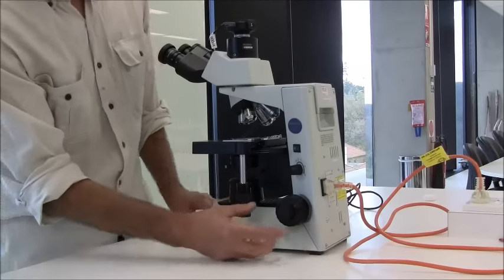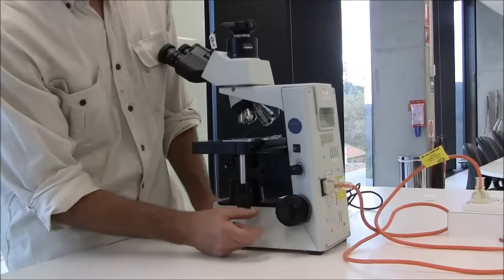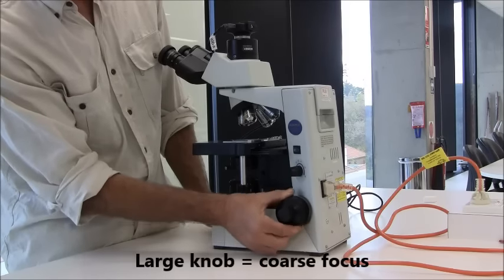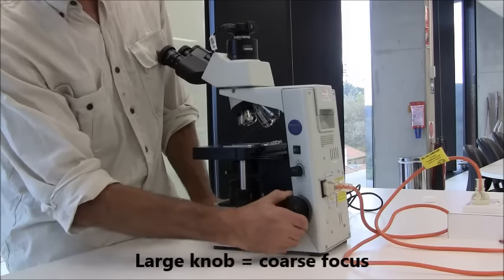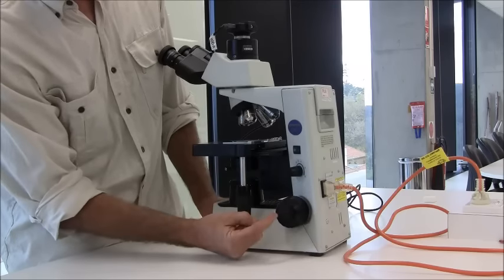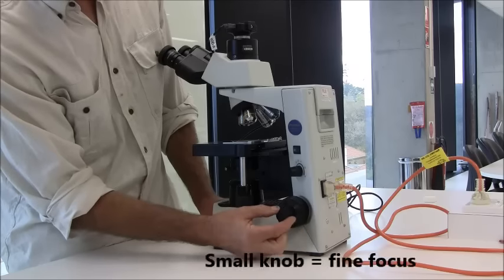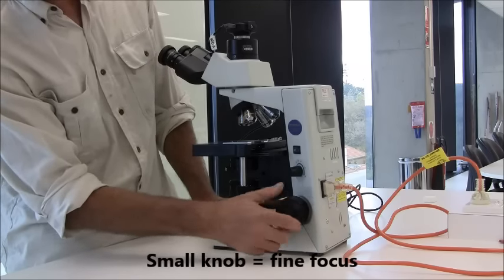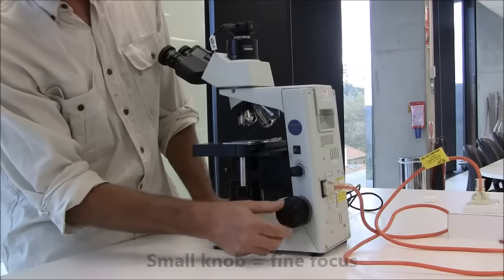Oh, the focus. There are two focus knobs. The larger knob on the outside is the coarse focus. And you can see when you move that, there's a lot of movement in the stage. And then on the inside of that larger knob is a smaller knob, and that's the fine focus. And you can see I can rotate that quite a lot. You don't see any movement in the stage at all.